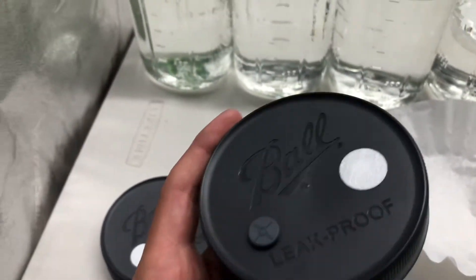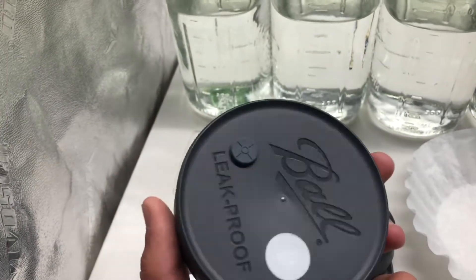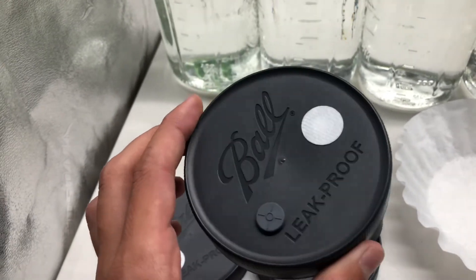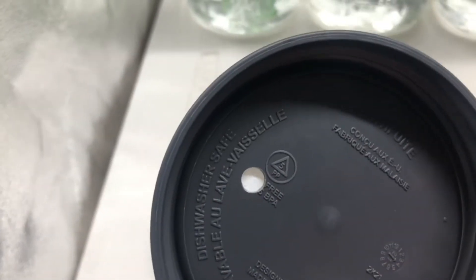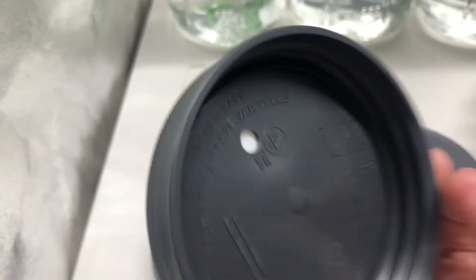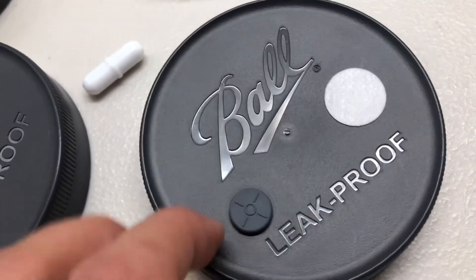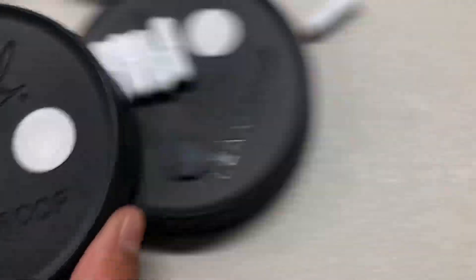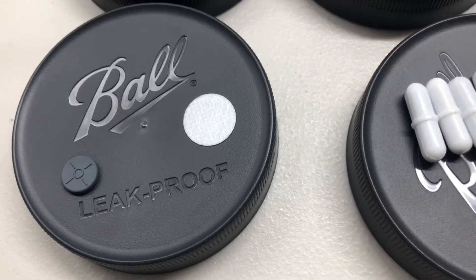Next I have these plastic mason jar lids. These are wide mouth, and the reason I use plastic is just so that you don't get any rust inside of the liquid culture. This is PP5, so autoclavable, and in these I've added a self-healing injection port and a Tyvek air filter to filter out any airborne contaminants that might hurt your mycelium.